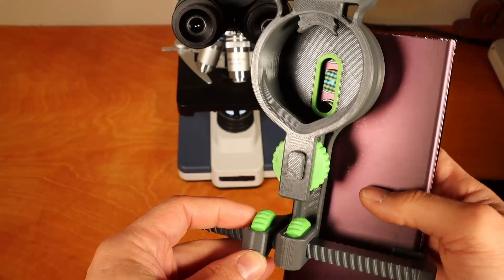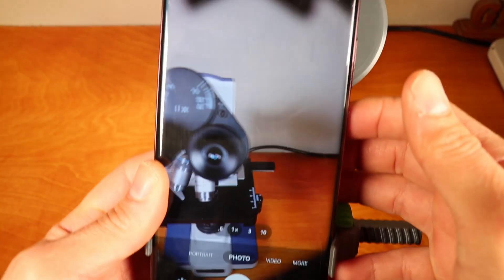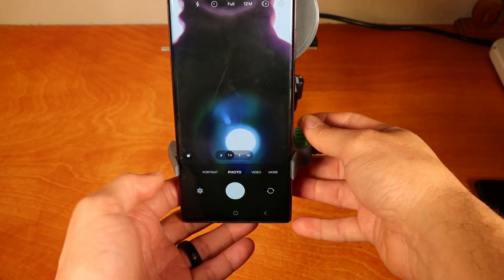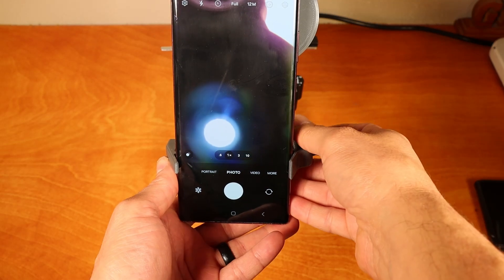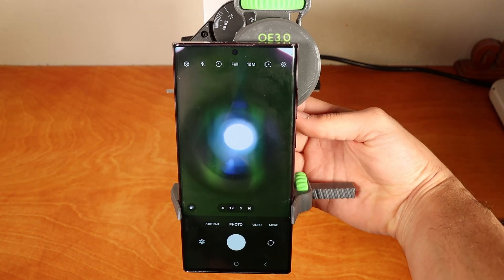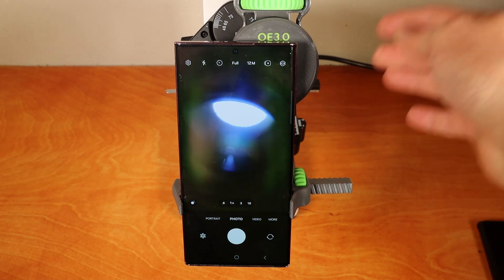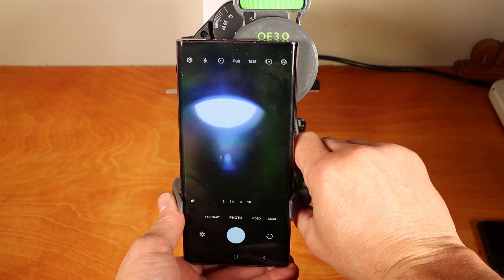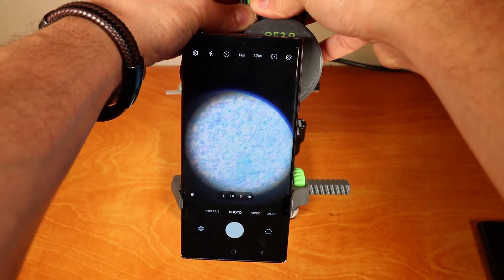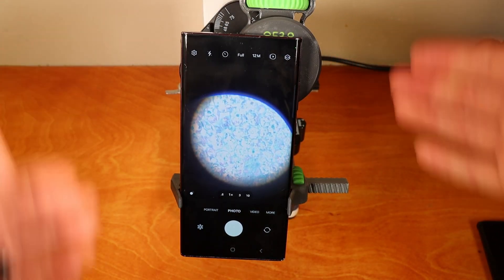With everything somewhat in place, we'll make some adjustments once everything is connected. I'm going to turn on the camera to make sure everything lines up the way I need it to. I can see I'll still need to move the Y a little bit to get this centered. Then I want to make sure the eye relief is good, so I'll turn the Z knob. I can see I need to move the adapter a little bit further down on the eyepiece.